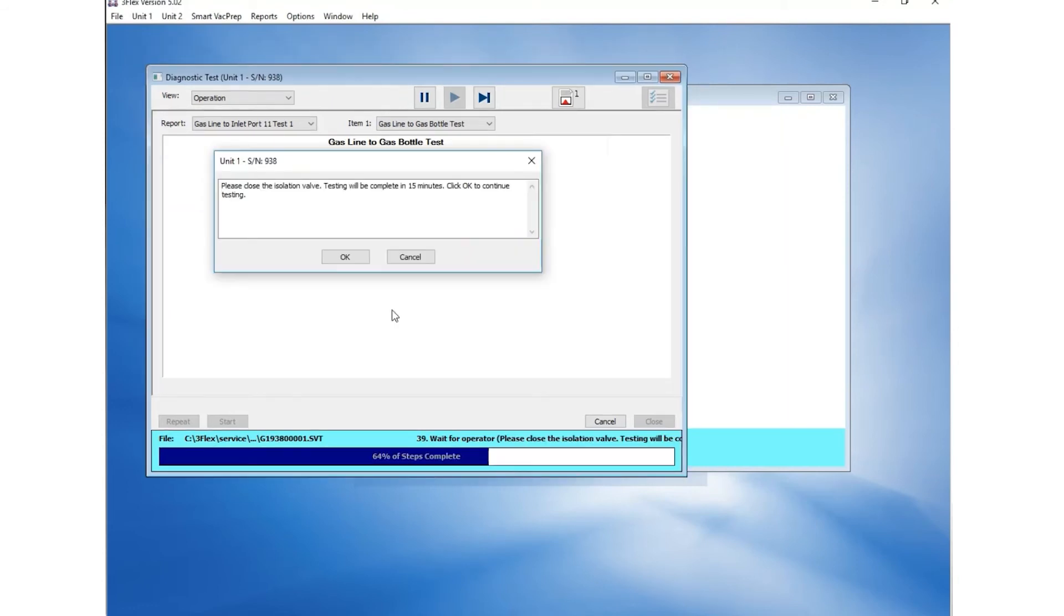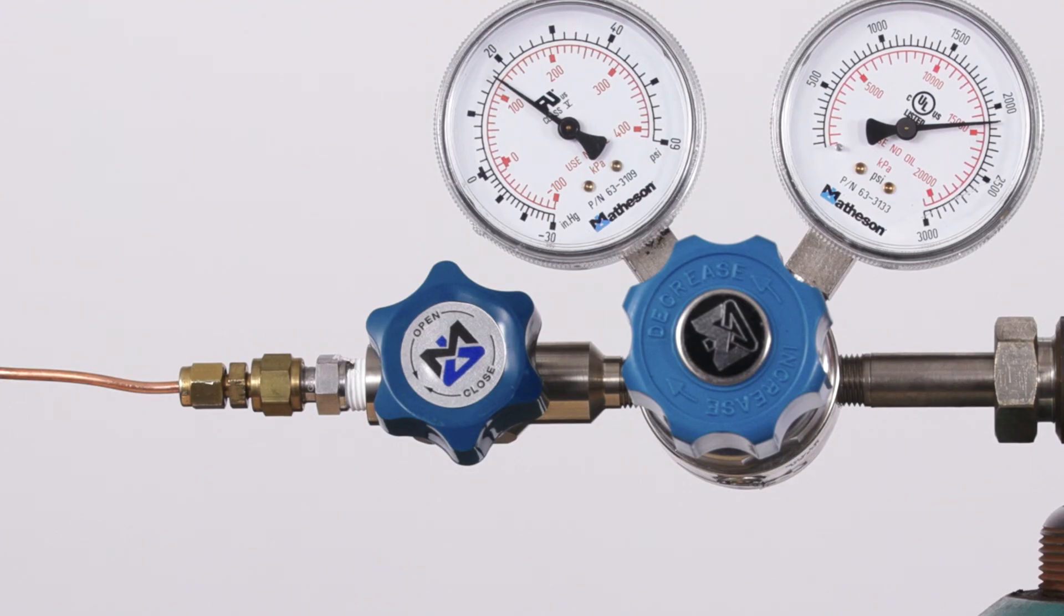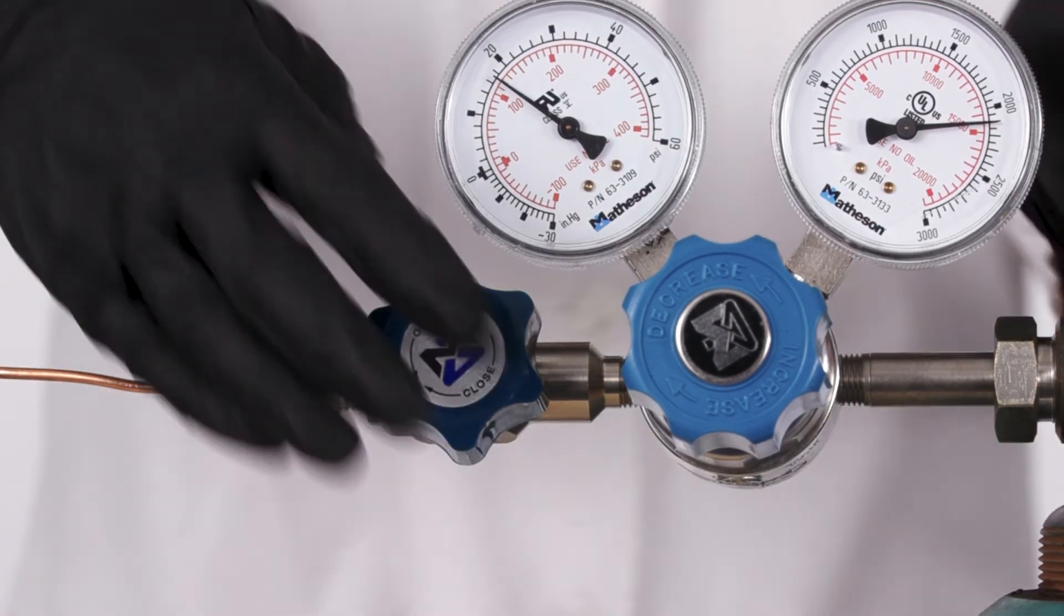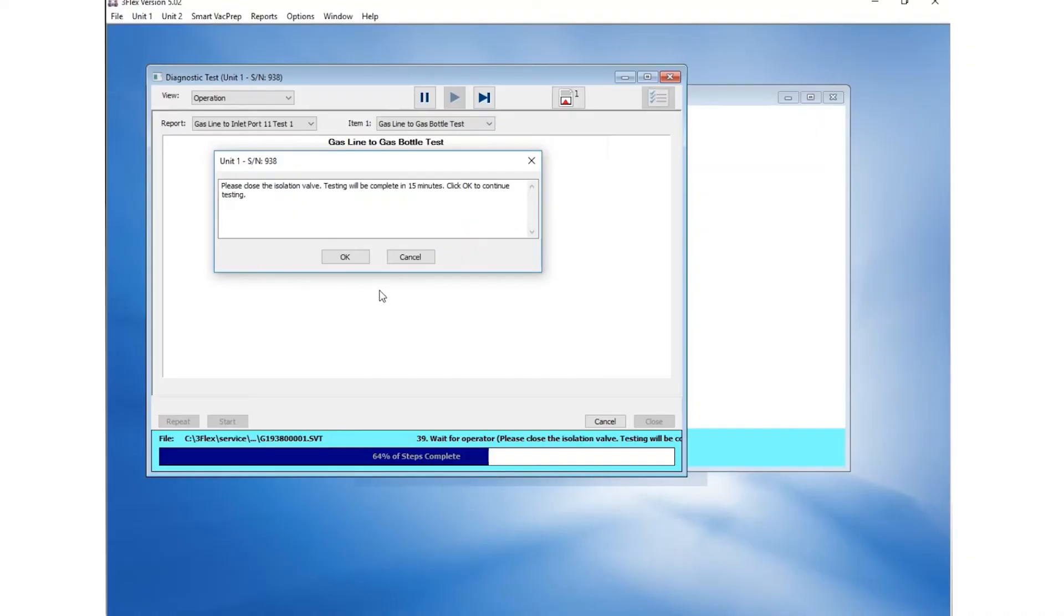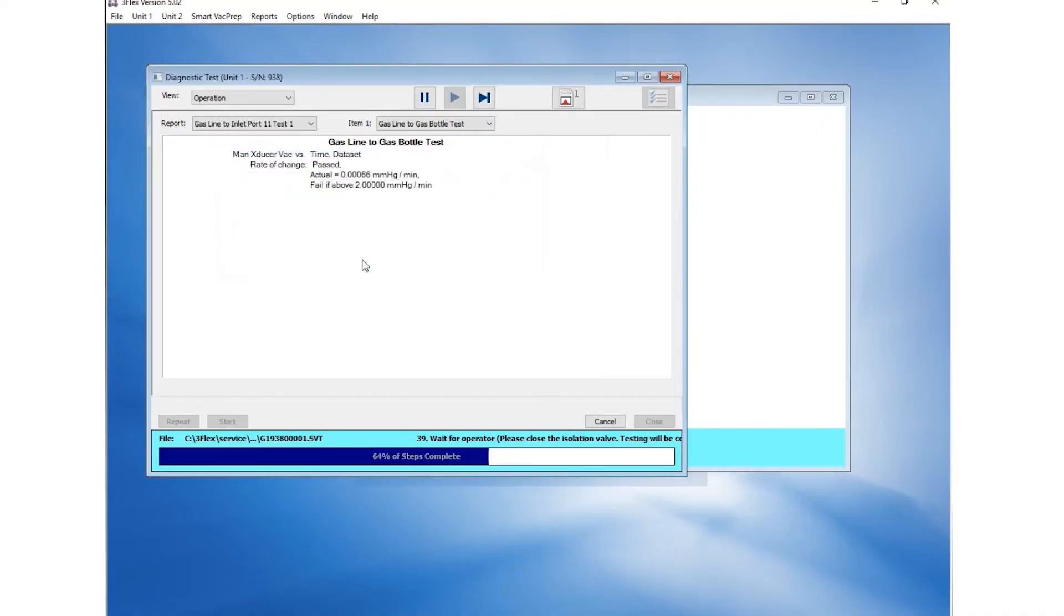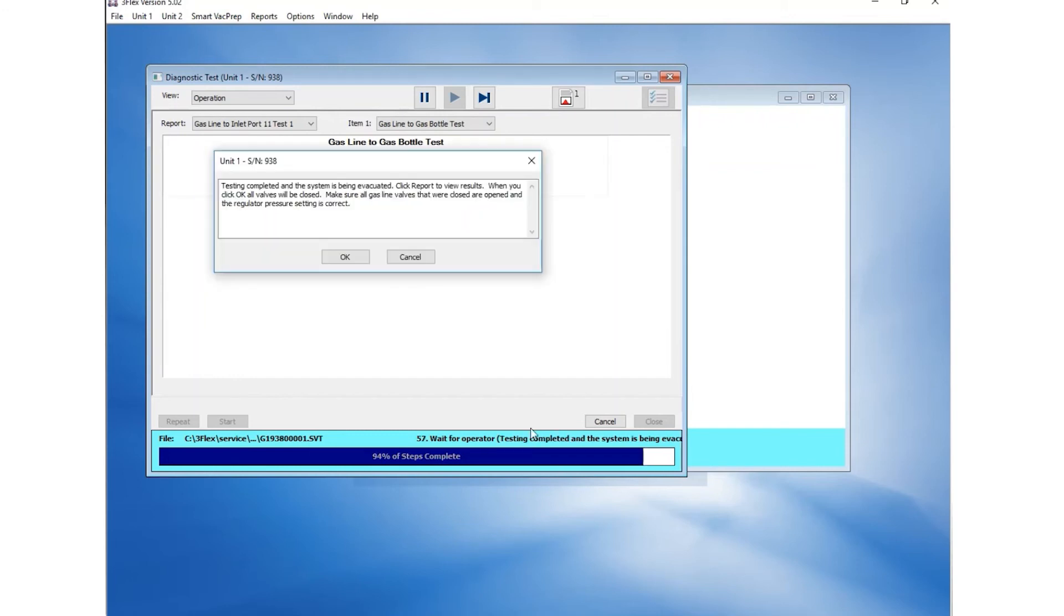After 30 minutes, you will be prompted to close the isolation valve. If no isolation valve is installed, close the regulator shutoff valve. After closing the valve, click OK and return in 15 minutes to complete the testing.